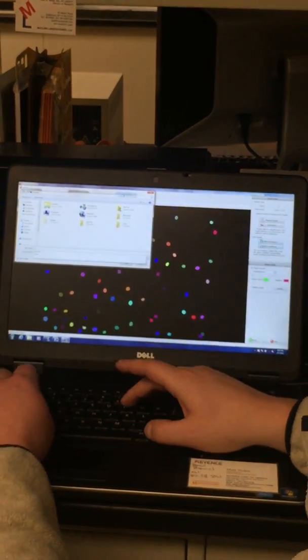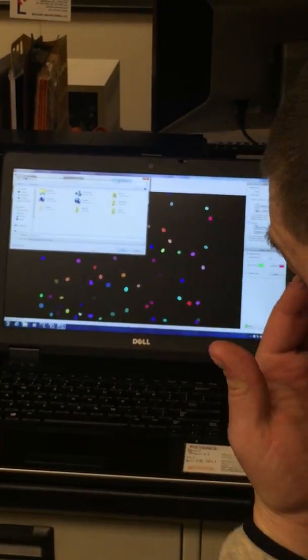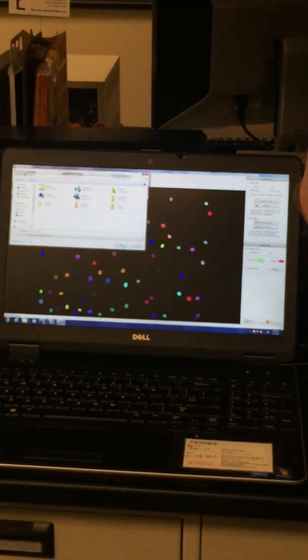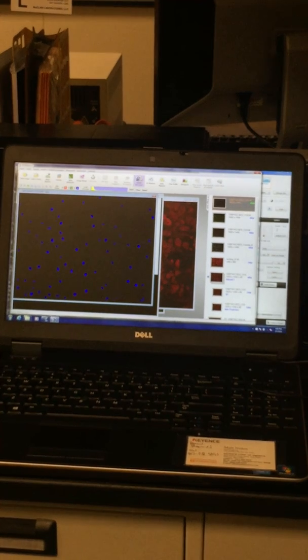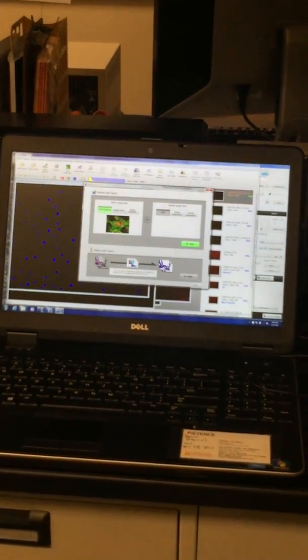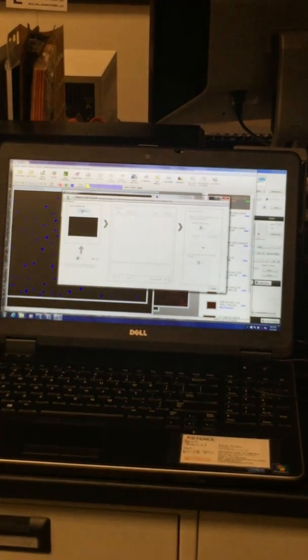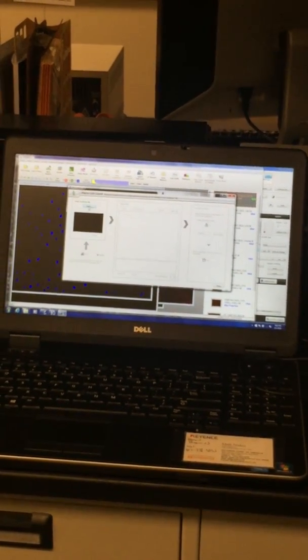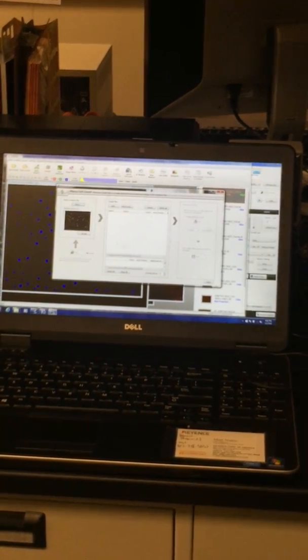So right now we're going to call this training count. Alright, I'm going to save it right to my desktop. So I'm going to X out of this. I'm going to go right back to hybrid cell count though, and then instead of doing anything up here, I'm going to start down here. So I'm going to go macro cell count. It's a 3-step process. You find your conditions file, so training, open. And then you add in your files here.